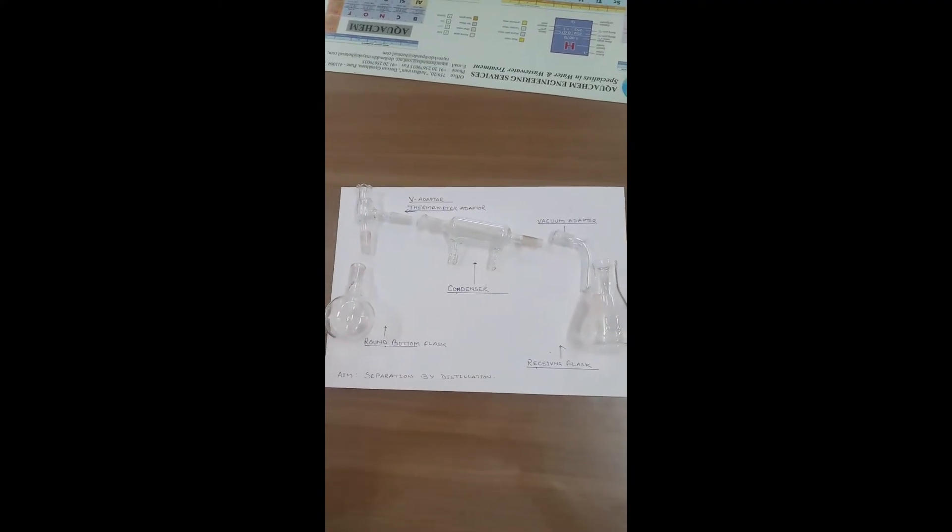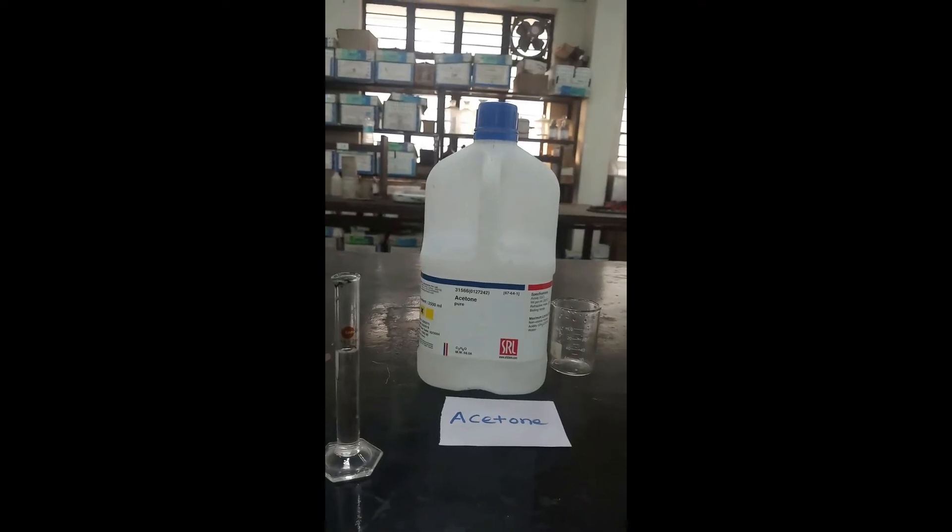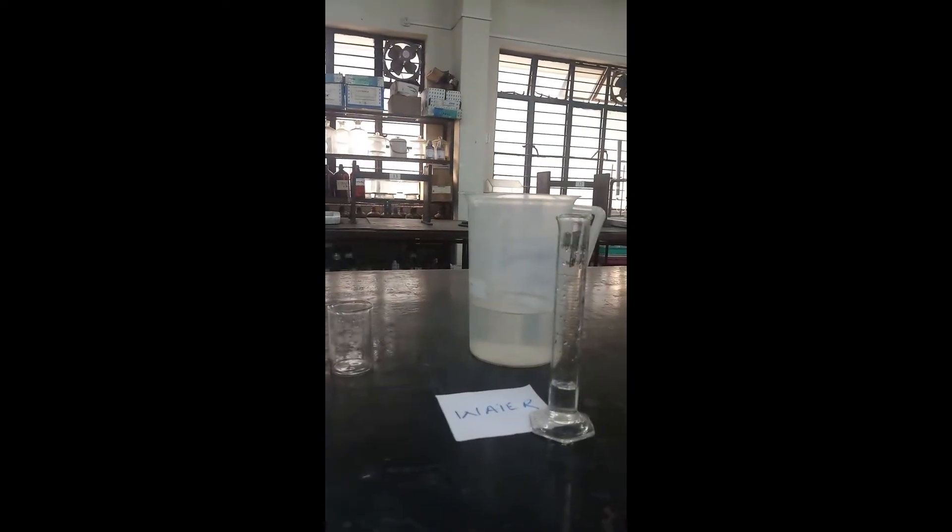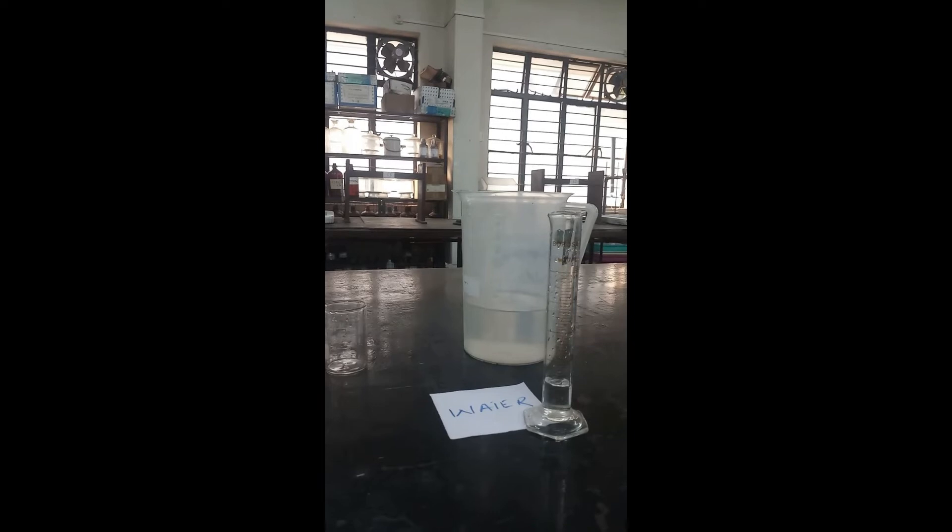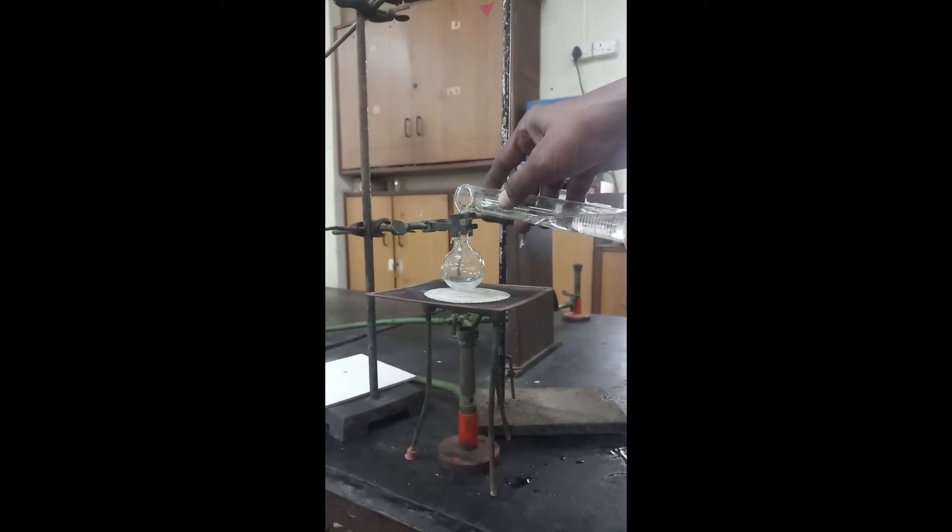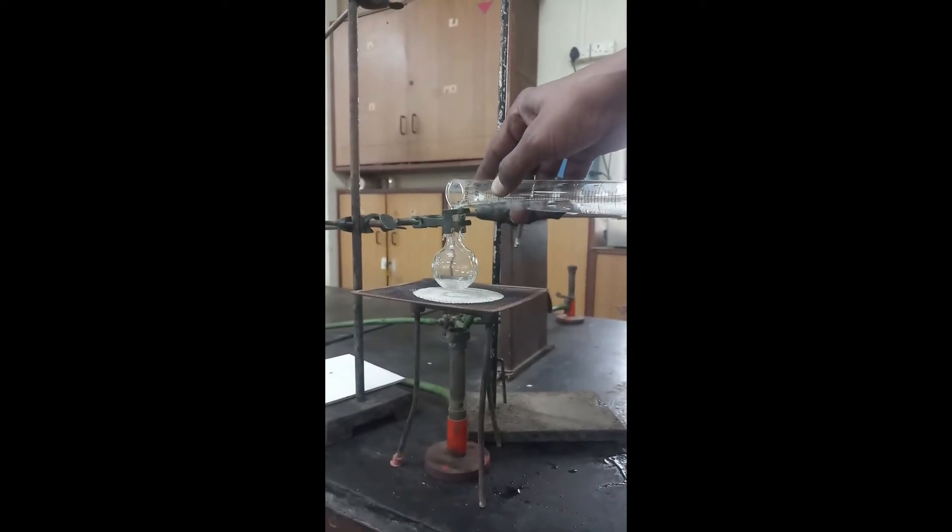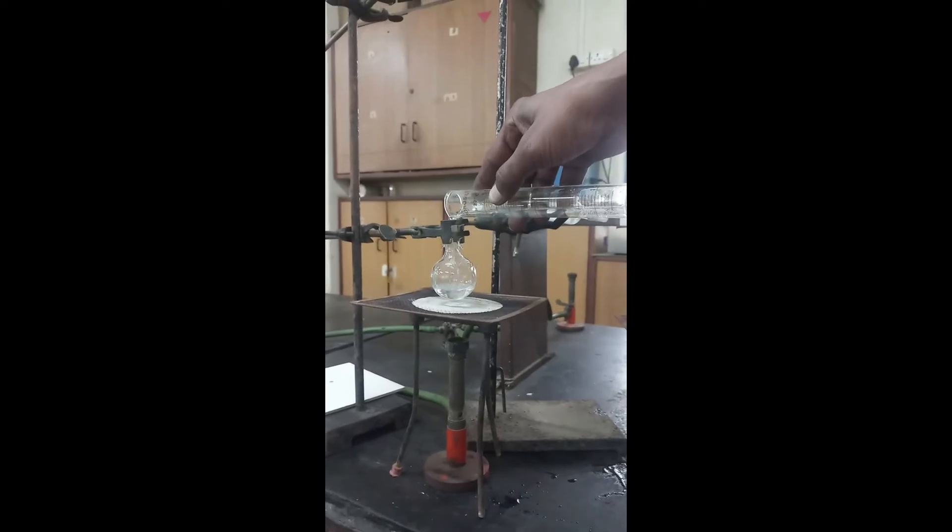This is the entire distillation unit. A mixture of acetone and distilled water will be given for separation. Pour 10 ml of the mixture of acetone and water in the round bottom flask clamped to the stand.